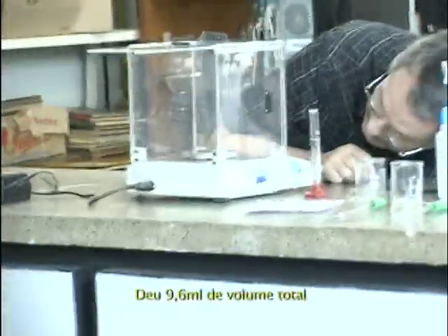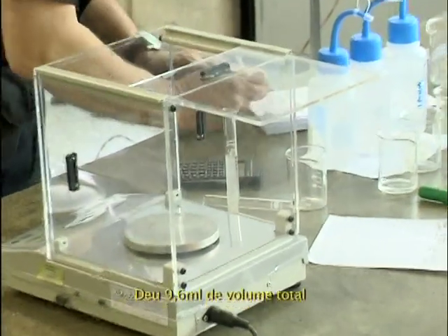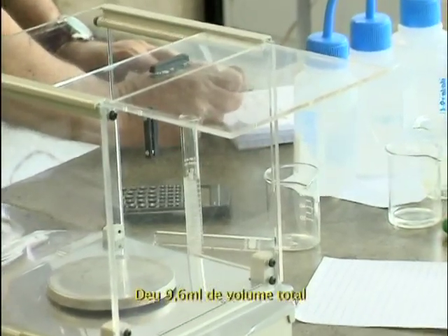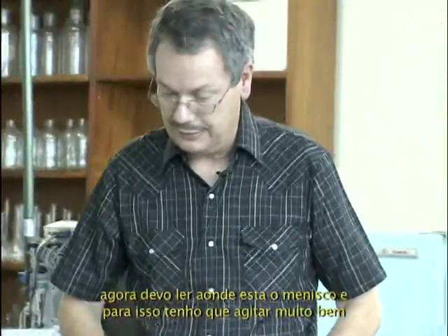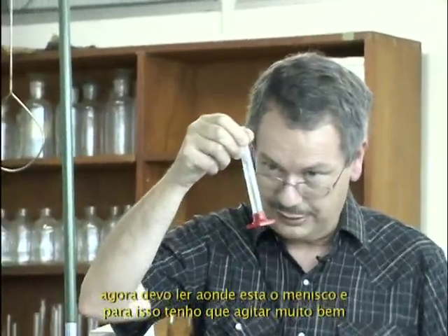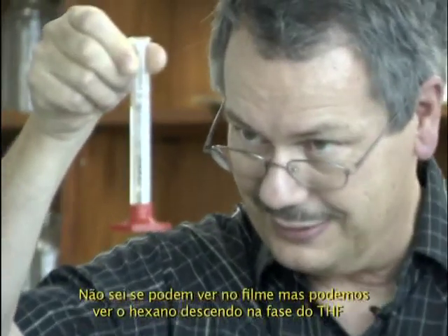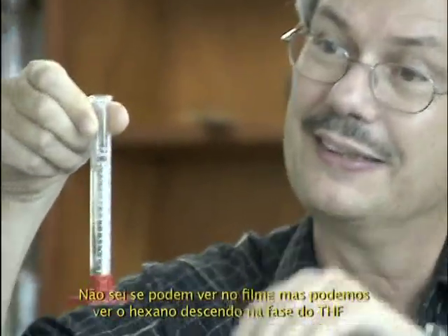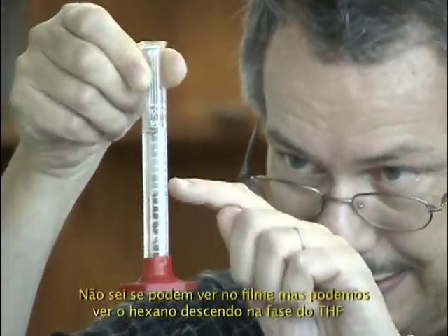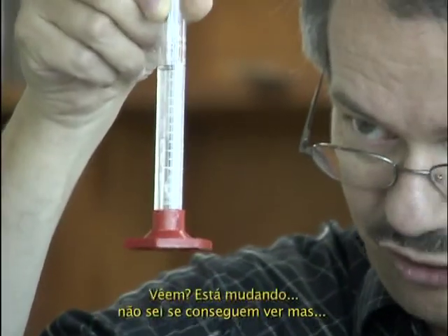how do you call this, cylinder? I have to put it on the table. It's 9.6 milliliters total. Now I should read where the meniscus is, and for this I should clearly shake it very well. And I don't know if it shows on the movie, but you can see the hexane going down in the THF phase at the meniscus. This is not a true meniscus. It's not equilibrated.